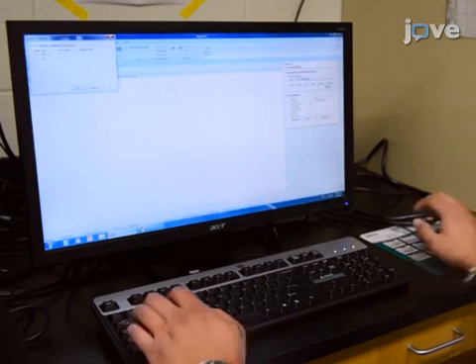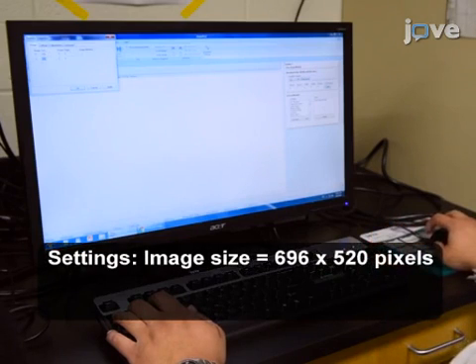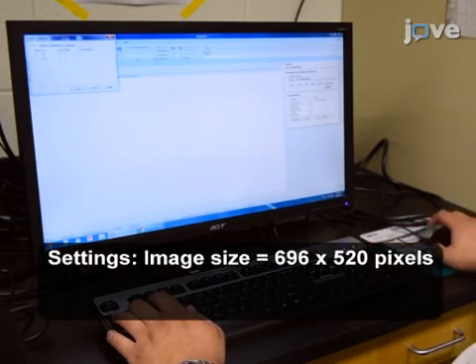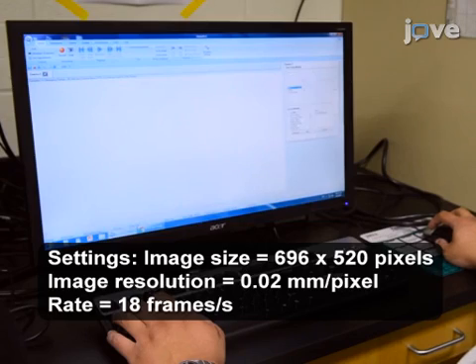Within the digital video recording software, set up the following settings: image size of 696 x 520 pixels, image resolution of 0.02 mm per pixel, and a rate of 18 frames per second.